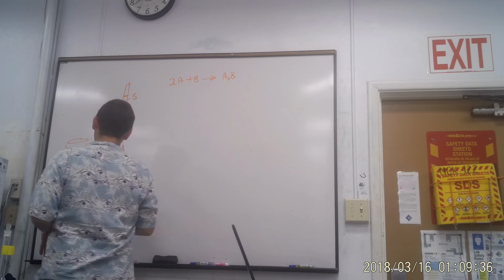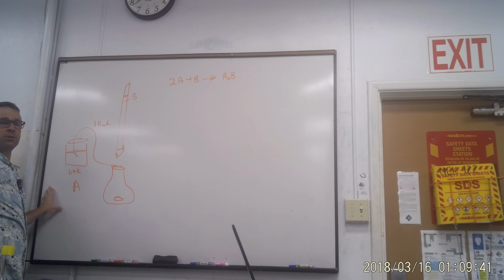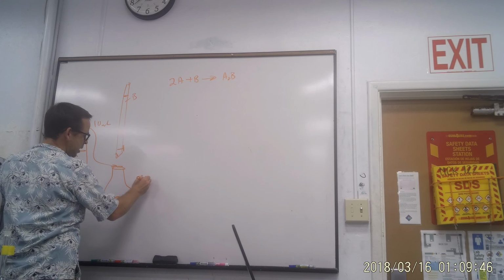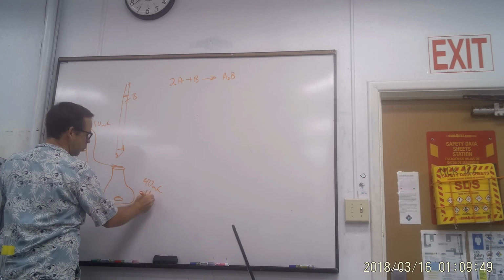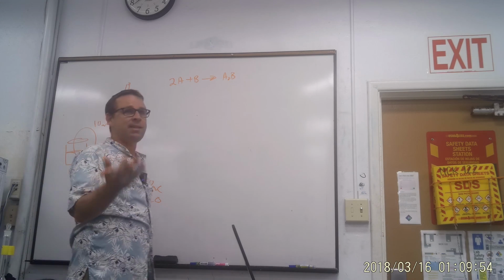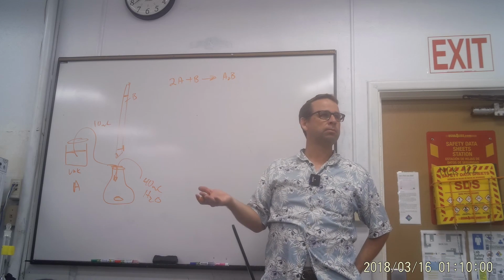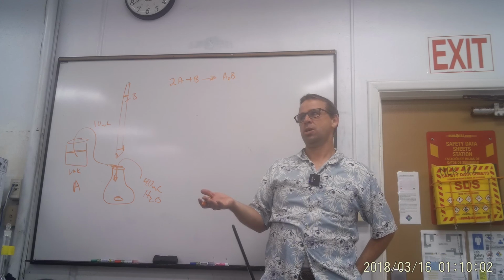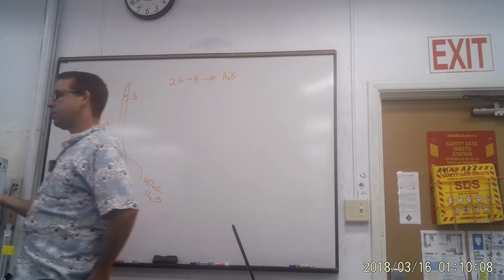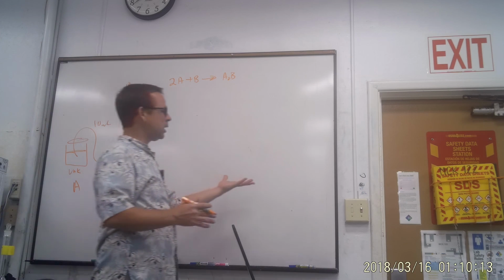All right. In here, I put 10 milliliters of unknown solution A, and let's say 40 milliliters of water. My standard, what should be my standard here? If A is my unknown, then what's my standard? B. B. So B is our standard.